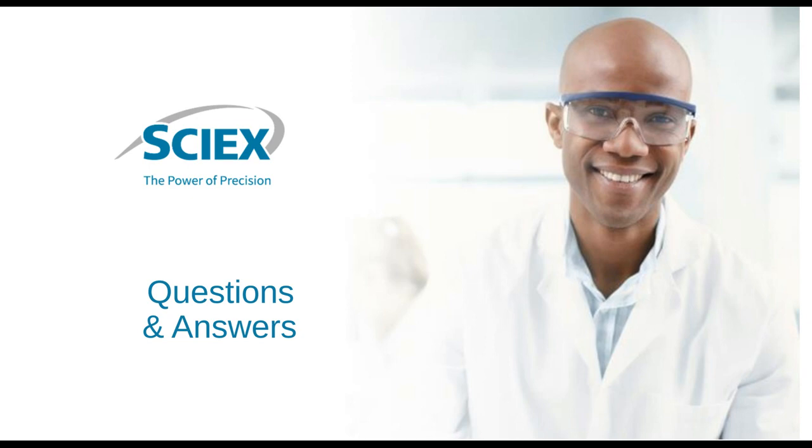Yeah, because I think with the 15 to 30 mer, if it's 30 mer, it'll definitely be 10K and above, so it should be fine then. Yeah. I know that the residual dye part is a lot less than the 10 kilodalton marker. Yeah, you have absolutely some room there as well.